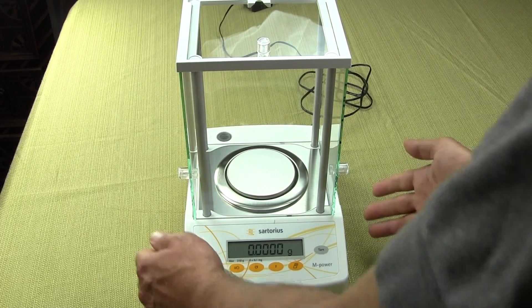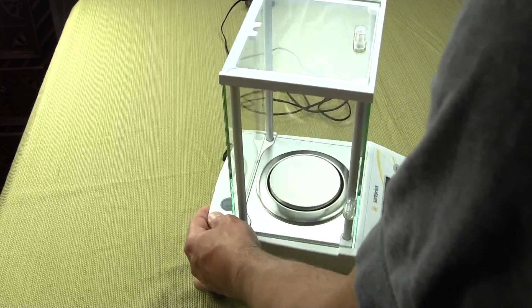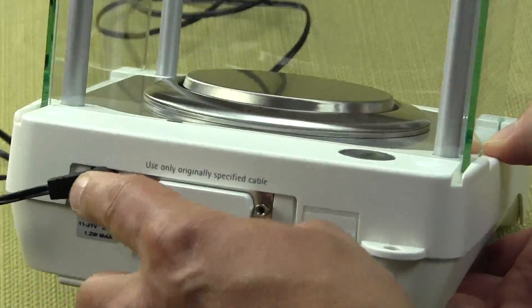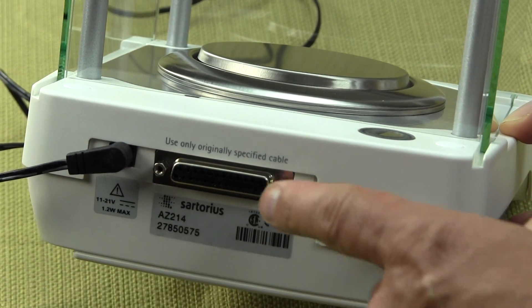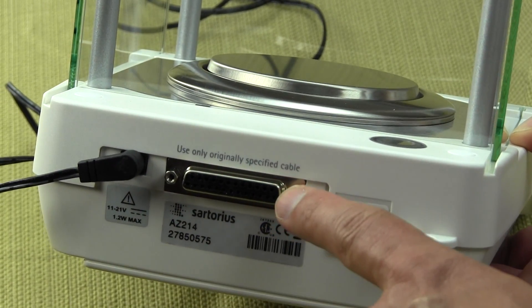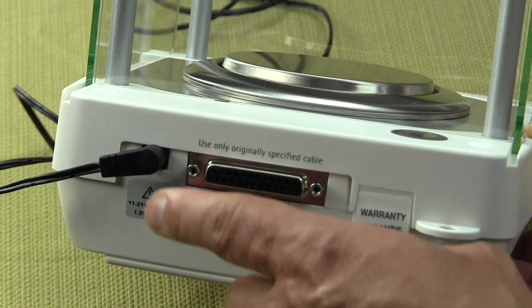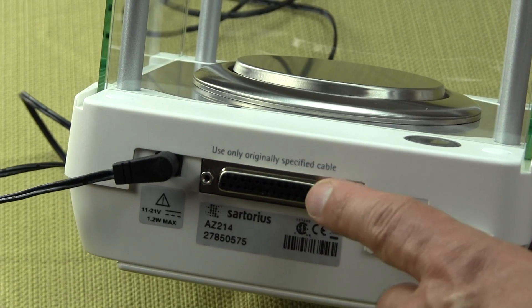The balance does operate off of AC adapter. It is not battery-powered. On the rear of the balance, you can see here, you have your AC adapter that comes standard. You also have an RS-232 interface that's standard. The RS-232 interface on the rear of the balance is a 25-pin connector.